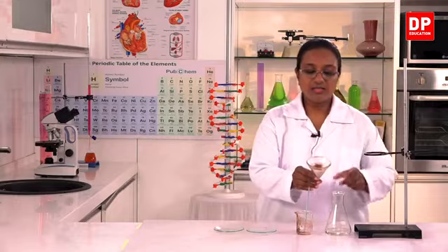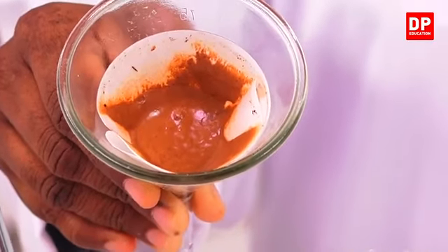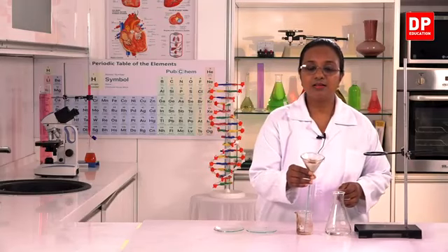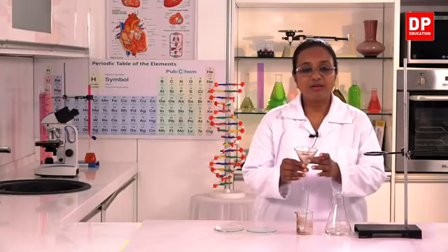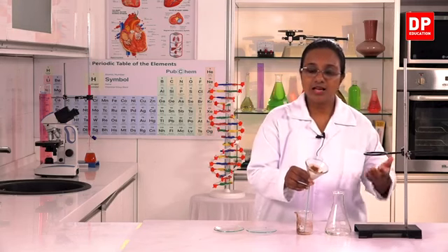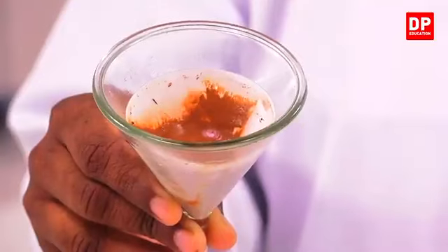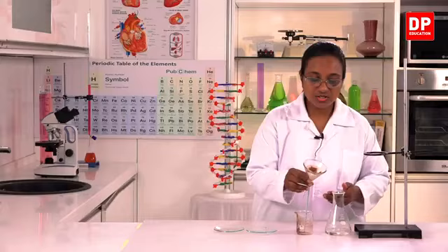So here you can see the residue, that is the soil residue that has been filtered by the filter paper. So what remains in the filter paper is the solid component that has large particle size. So therefore it doesn't get filtered through the filter paper, and that is called the residue.